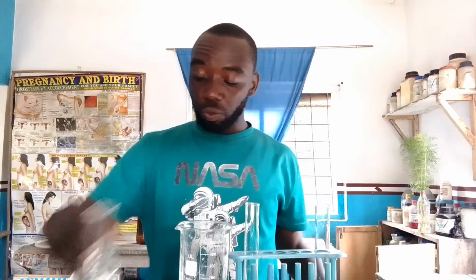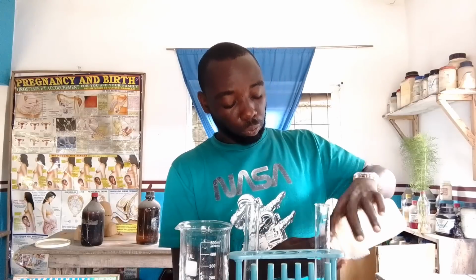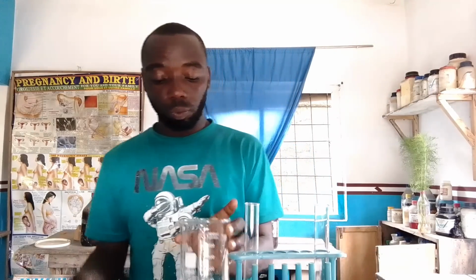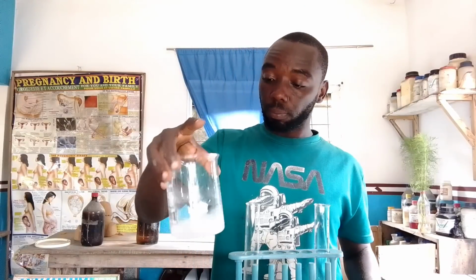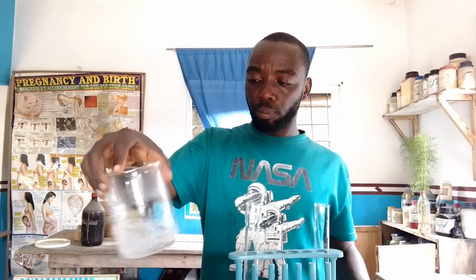You have to dissolve your sodium hydroxide in water, but they said solution, so you dissolve it in water. So it has properly dissolved.